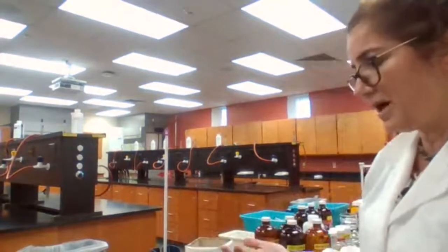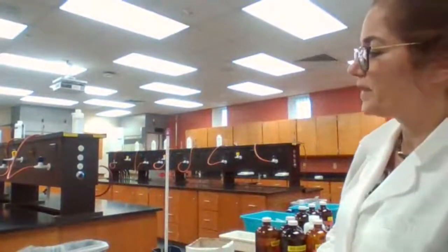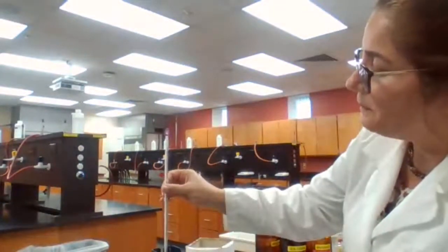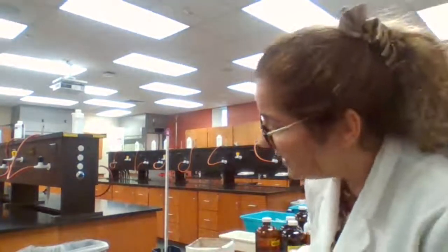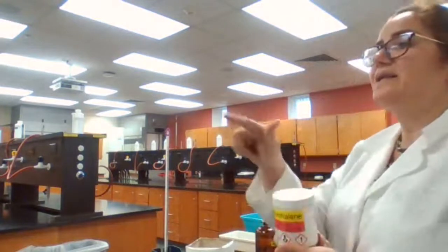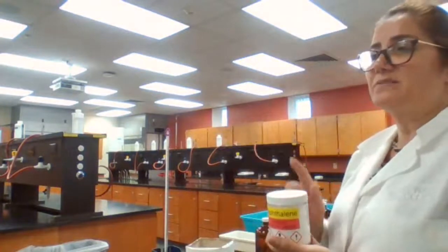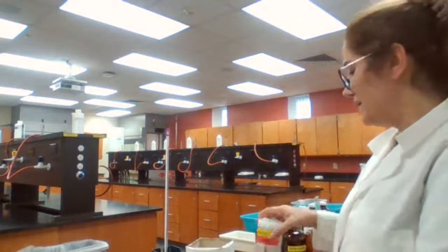And keep monitoring, checking for the melting point. This way, you don't have to do the work a couple of times. The temperature is at 60 and has not melted yet. This compound that I'm using is naphthalene, and that is for experiment B, the experimental melting point range for naphthalene. I'm trying to find out.